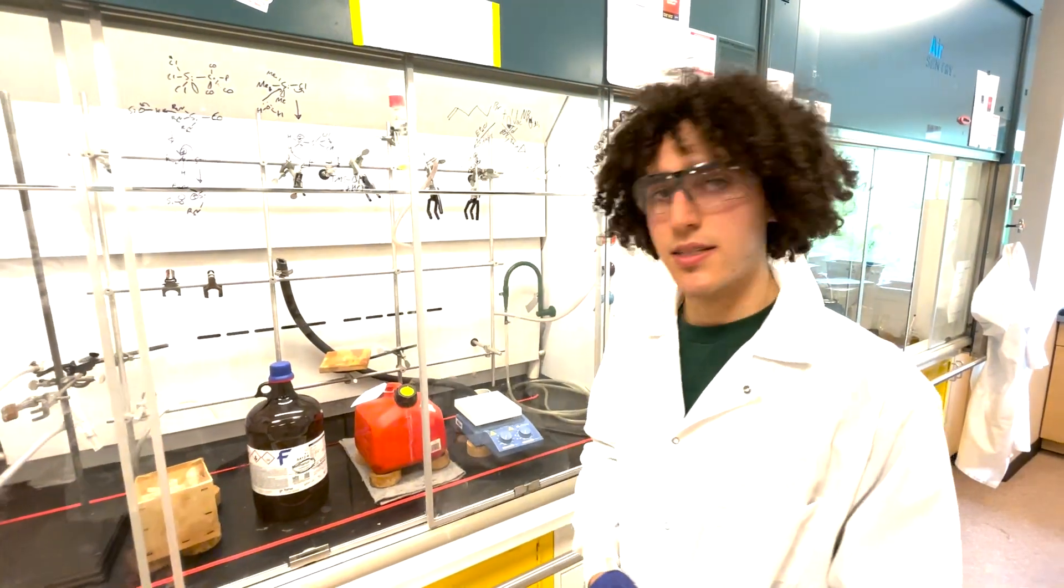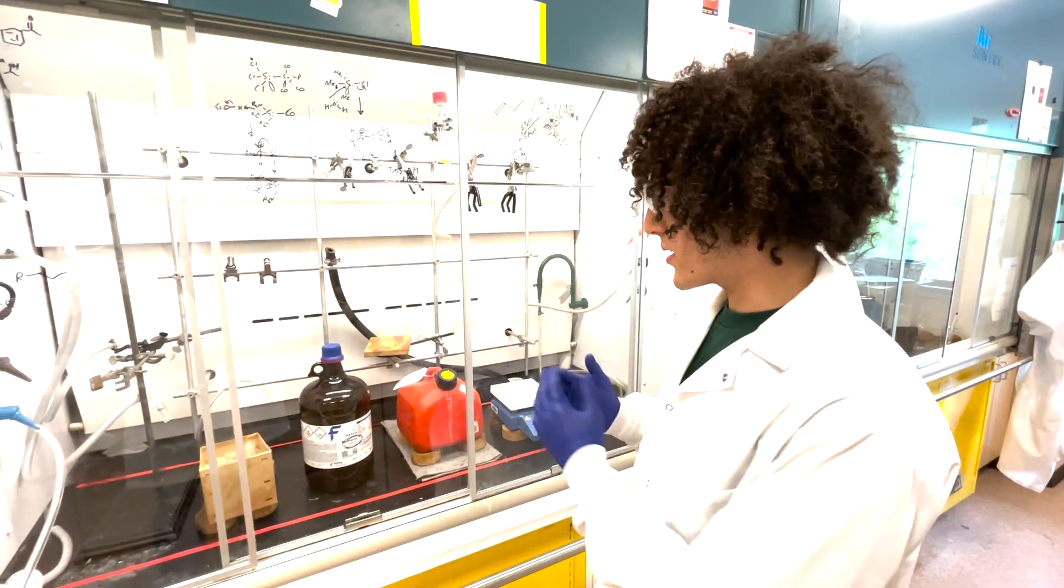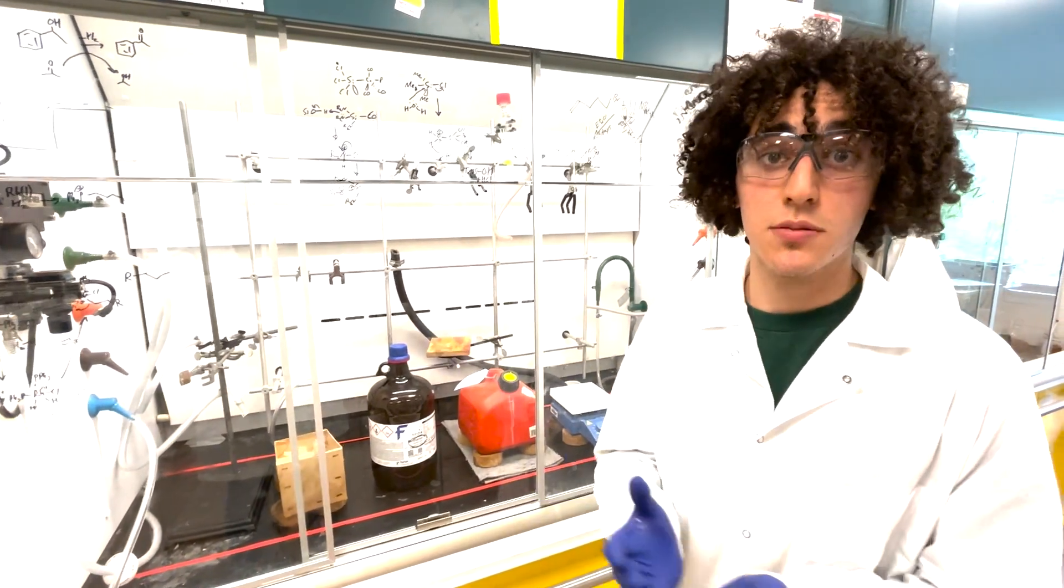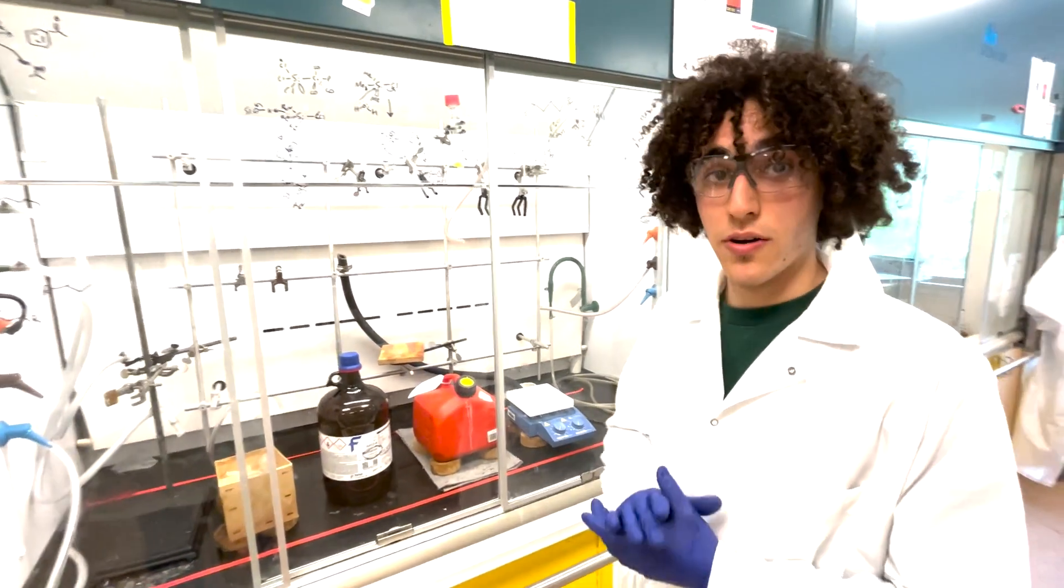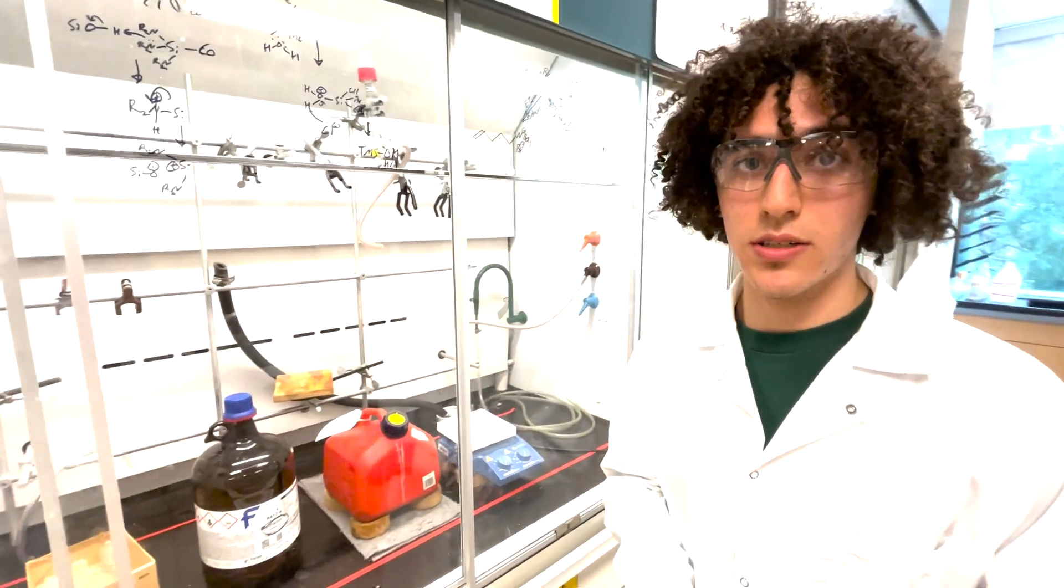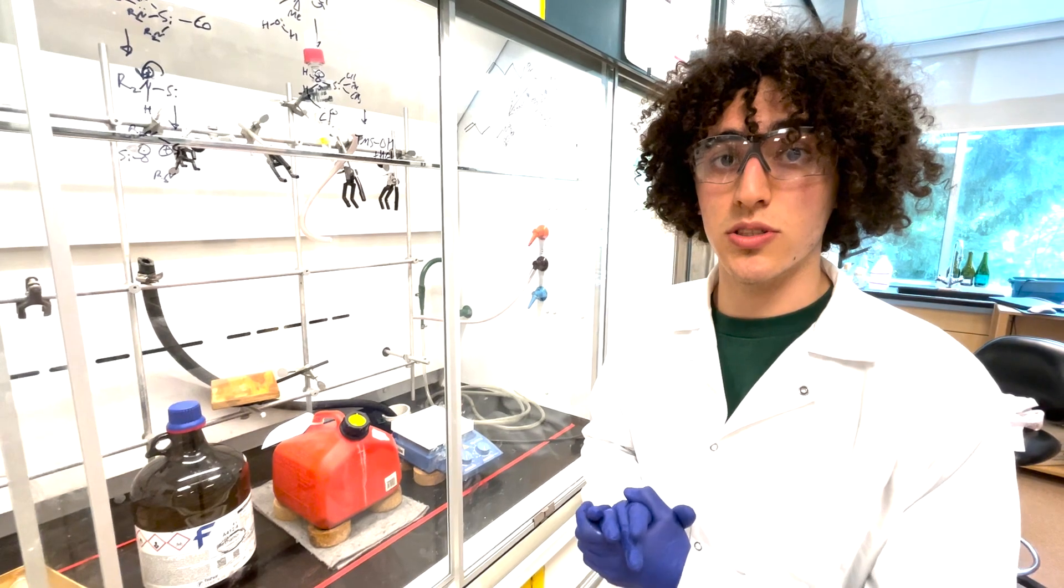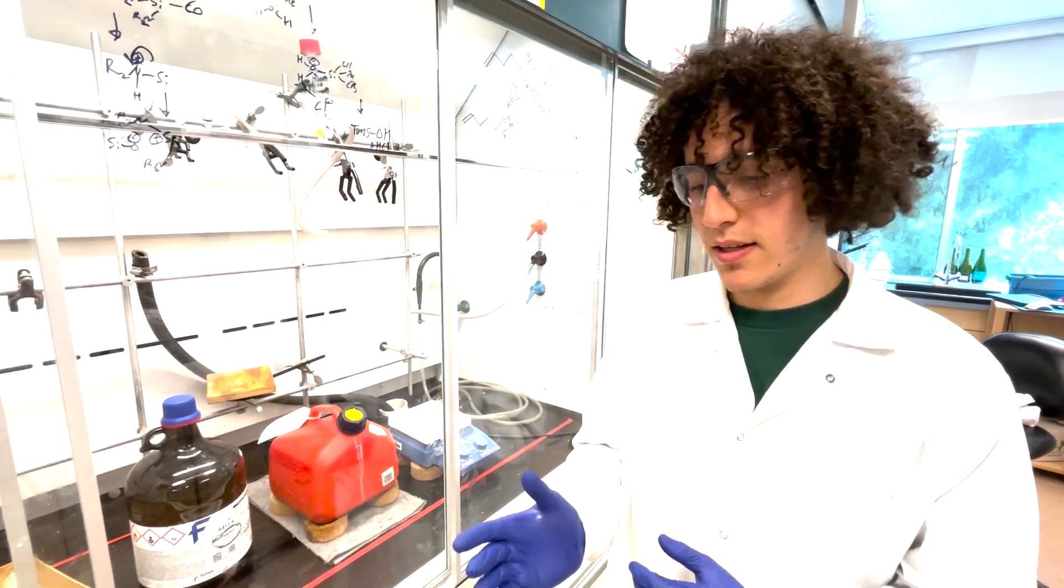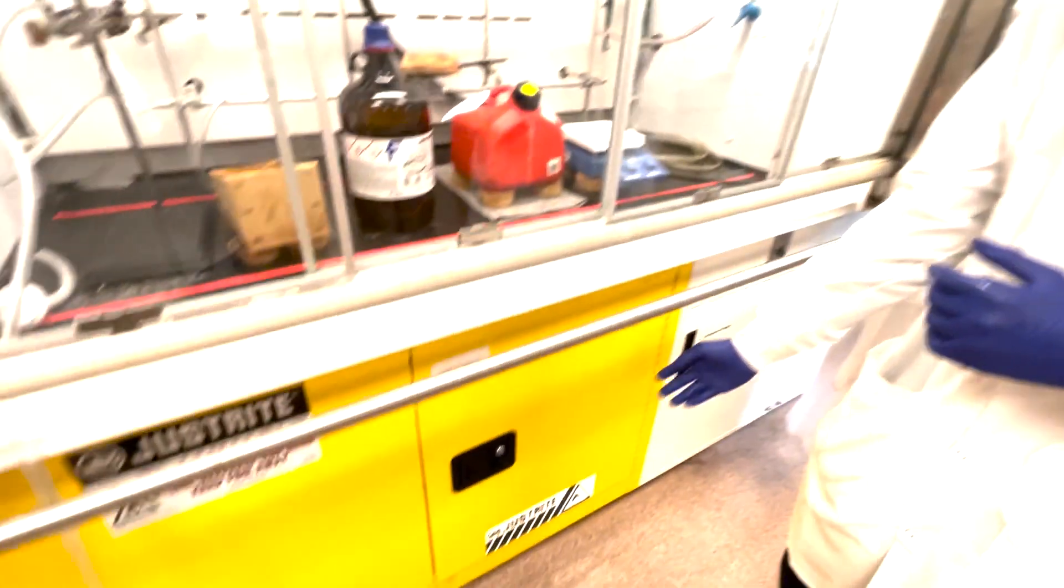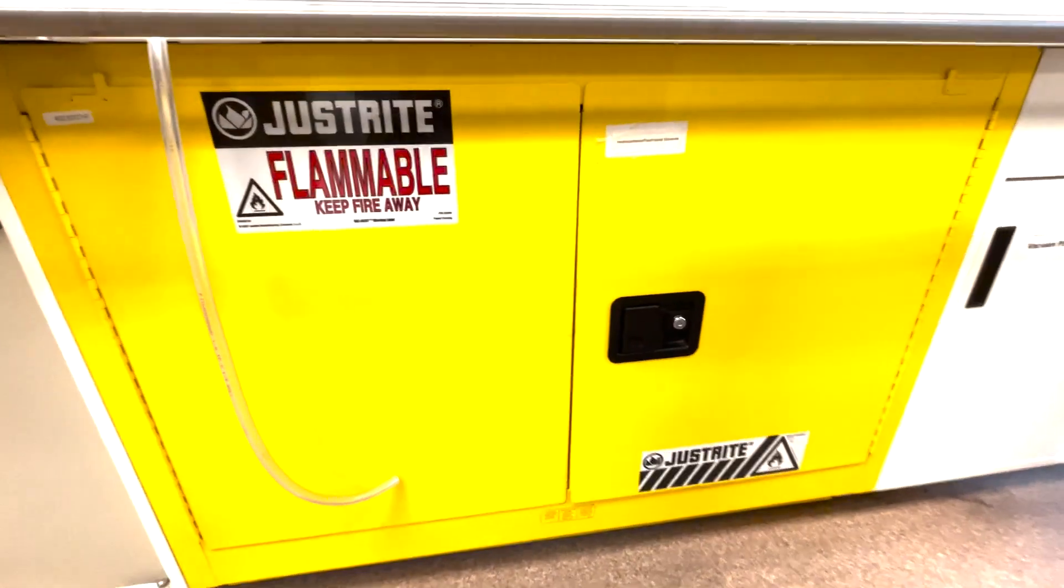Fume hoods are intended for researchers to conduct experiments in a protected environment so that vapors do not spill over the edge. They are not intended for chemical storage. It is inappropriate to use a fume hood for long-term chemical storage and instead safety cabinets such as the ones below a fume hood are appropriate.